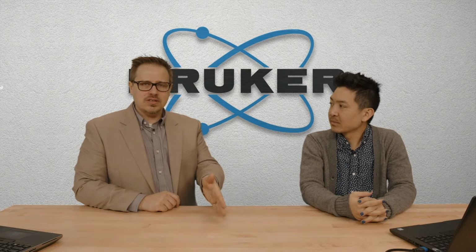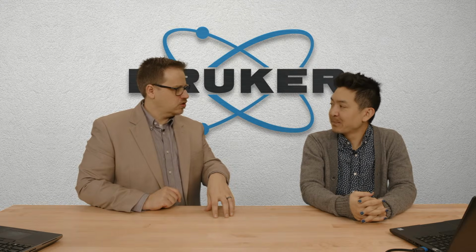Yep. The way it works is that your license on your dongle might version lock certain features if we have new features. You can always run our latest version of EVA. Always run the latest, so you'll always have bug fixes, and sometimes we do put new features in there for everybody.